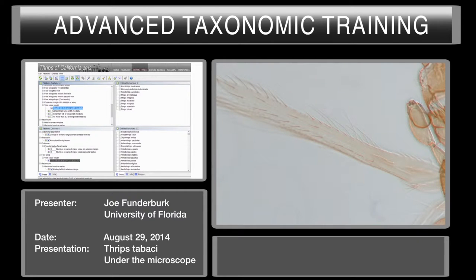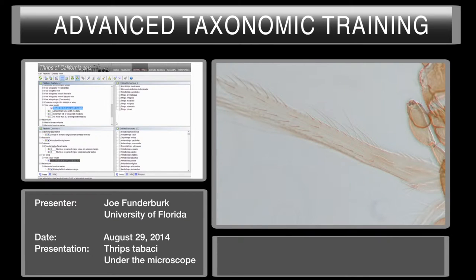So I'm going to choose that. We're down to nine species at this point. By the way, this wing looks like it might actually be upside down by the way it's mounted — sometimes we don't have perfect specimens to work with — but we can still see the characters well enough.